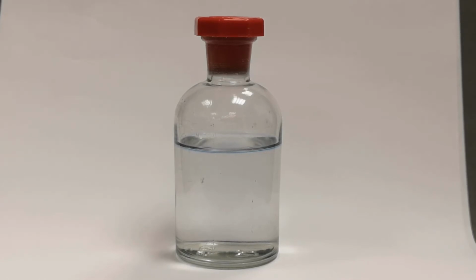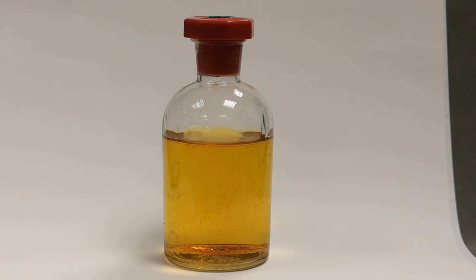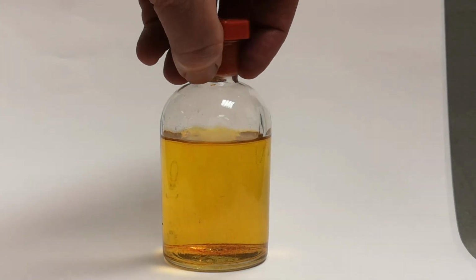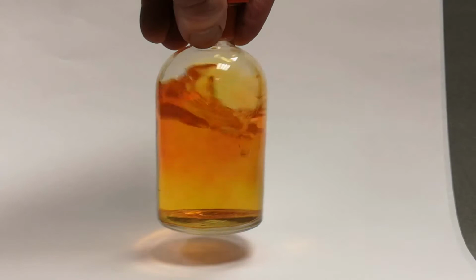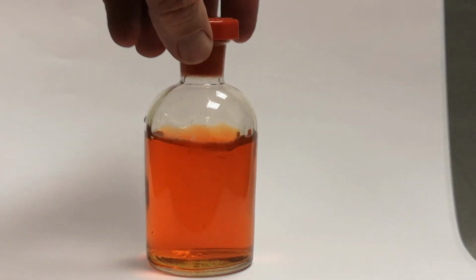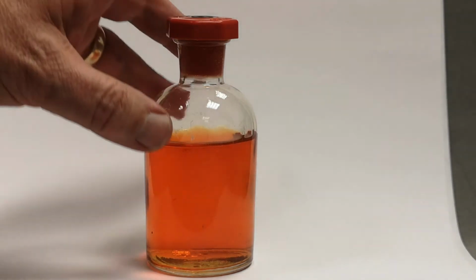There are several other redox dyes that act in a similar way. Safranin, for instance, changes from pink to colourless and back. An interesting alternative is indigo carmine. This forms a basis of a demonstration known as traffic lights. The experiment is set up in exactly the same way, only using indigo carmine instead of the methylene blue.